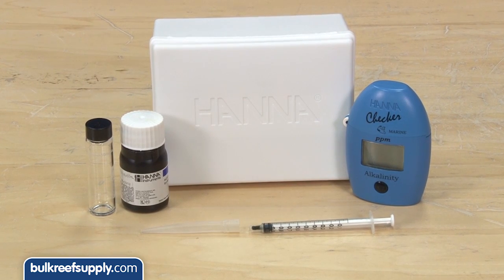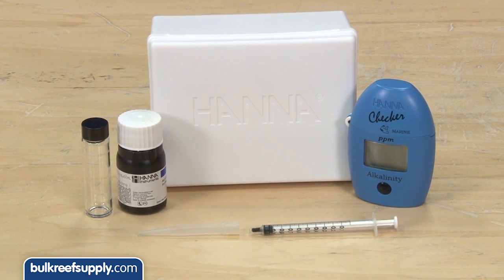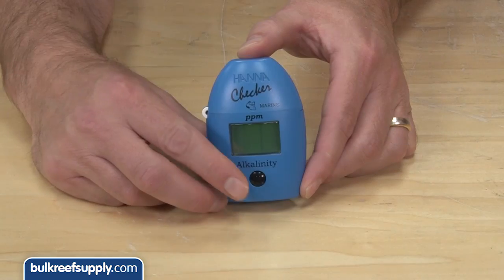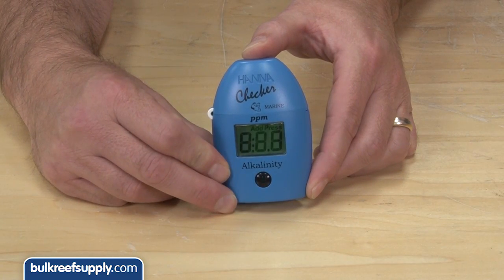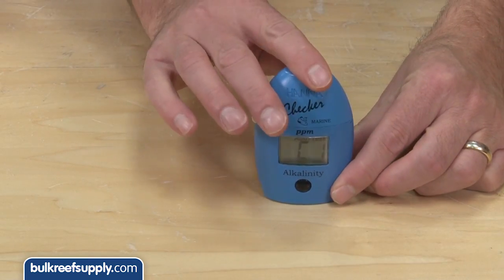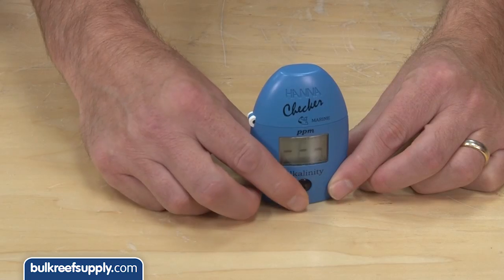Most experienced reefers will agree that alkalinity is probably the most common and important parameter to keep closer tabs on, so we are going to start with that one. Step one is to turn the checker on by hitting the button, then fill the cuvette to the ten milliliter line with water from the tank. Put the sample in the checker and hit the button and it will zero in a matter of seconds.